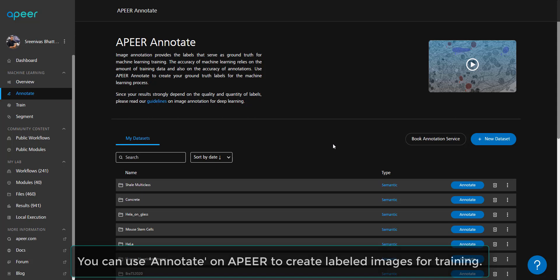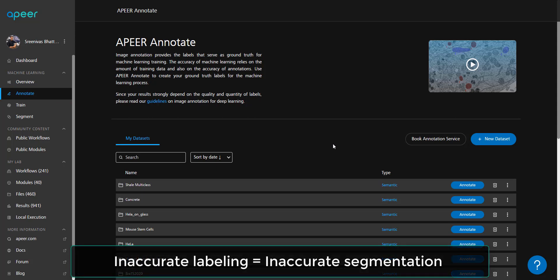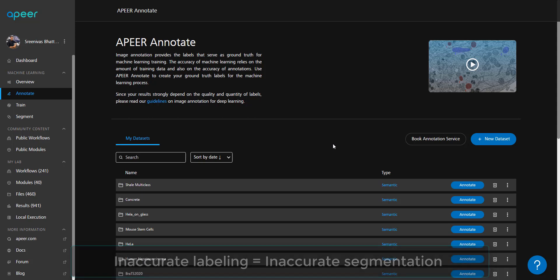Deep learning requires a lot of annotated data to train millions of parameters, so please be patient with annotations as you may be using the trained model over a long period.